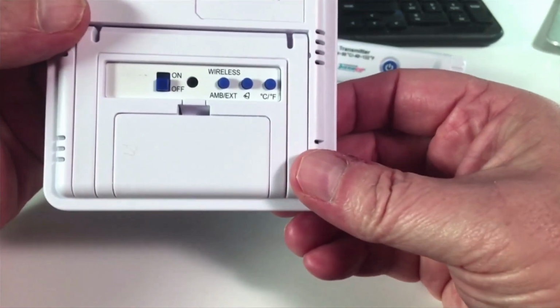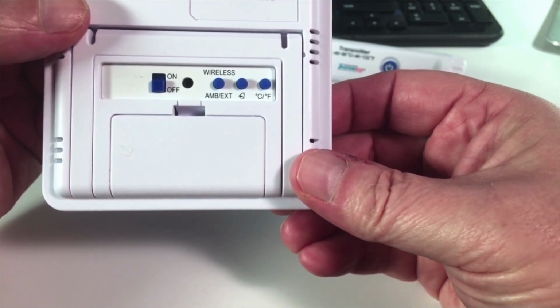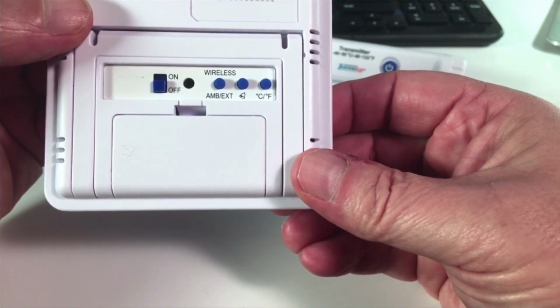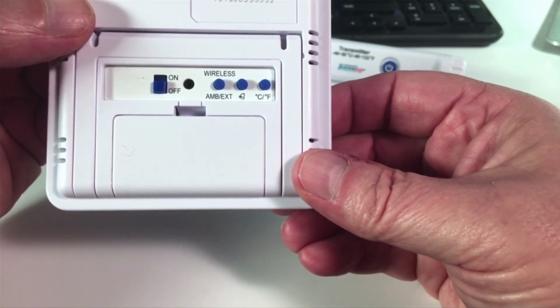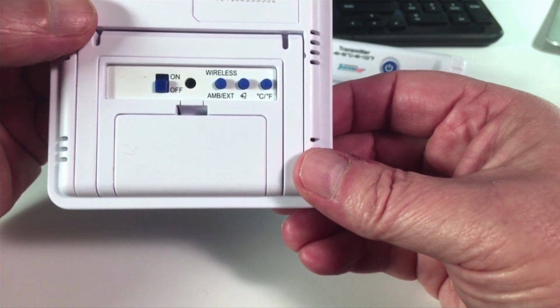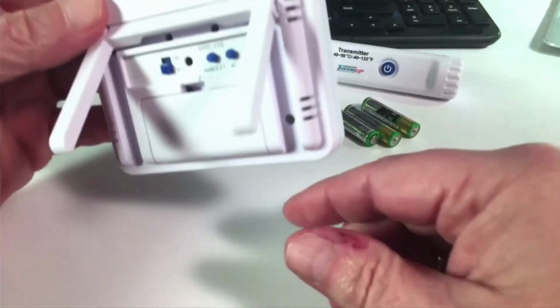On the back you have an on-off switch, a button for wireless, ambient, external to choose your temperature sensor of your choice. Next to that is another button with a bell, and that's to activate or deactivate the alarm. And to the right of that you have a C/F switch, and that's to select either the Celsius or Fahrenheit scale on the display. Battery compartment and a kick-out desk stand.